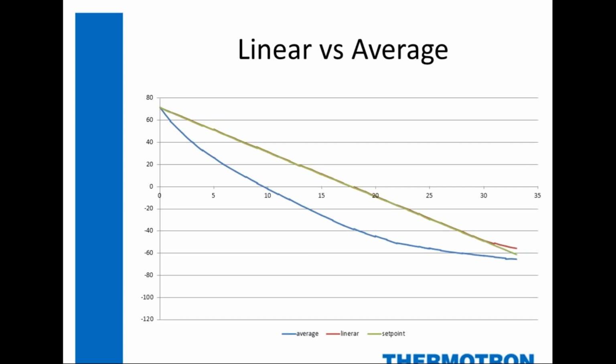Another pretty important consideration when looking at those specifications is: is it specified as an average change rate or a linear ramp? And this was something, again, we even saw back in the salt spray. Are you trying to change at the fastest possible ramp rate, or is it a linear change?